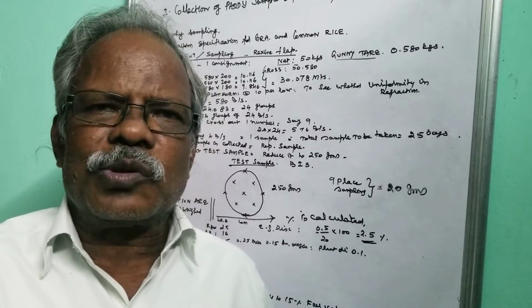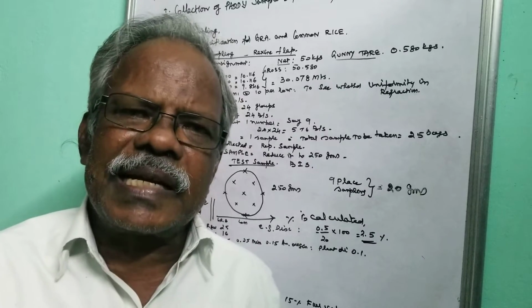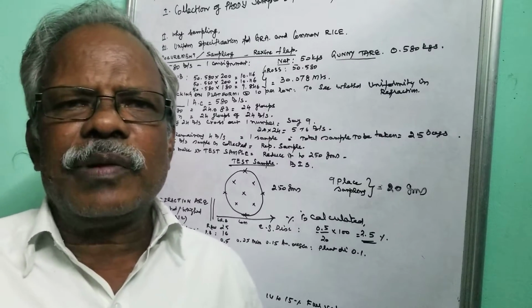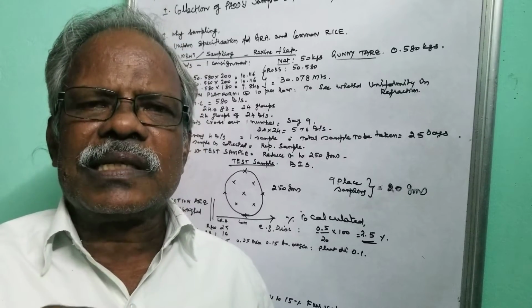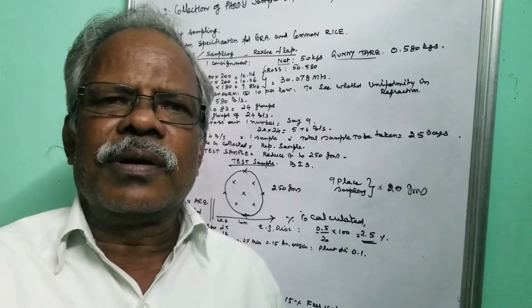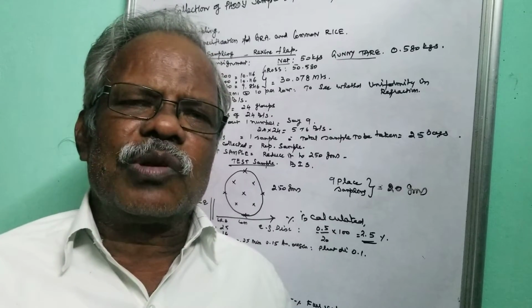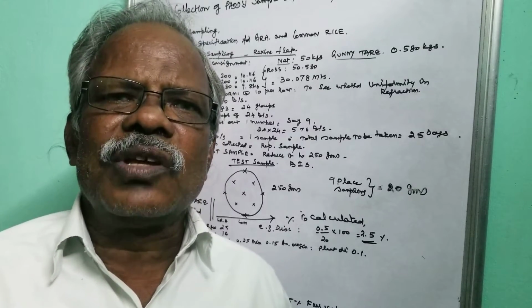That is taken up through the uniform specification, and that is circulated all over India, and that is the basic standard for the refractions. Refraction means deviation from the normal one. All the rice will not be of uniform nature. It may contain some brokens, some discolored grains, from normal white to yellow, or damaged rice, that is black in color, which may not have food value, and chalky. The refractions deviated from the normal one, they will analyze, and the percentage is fixed. That is called uniform specification.